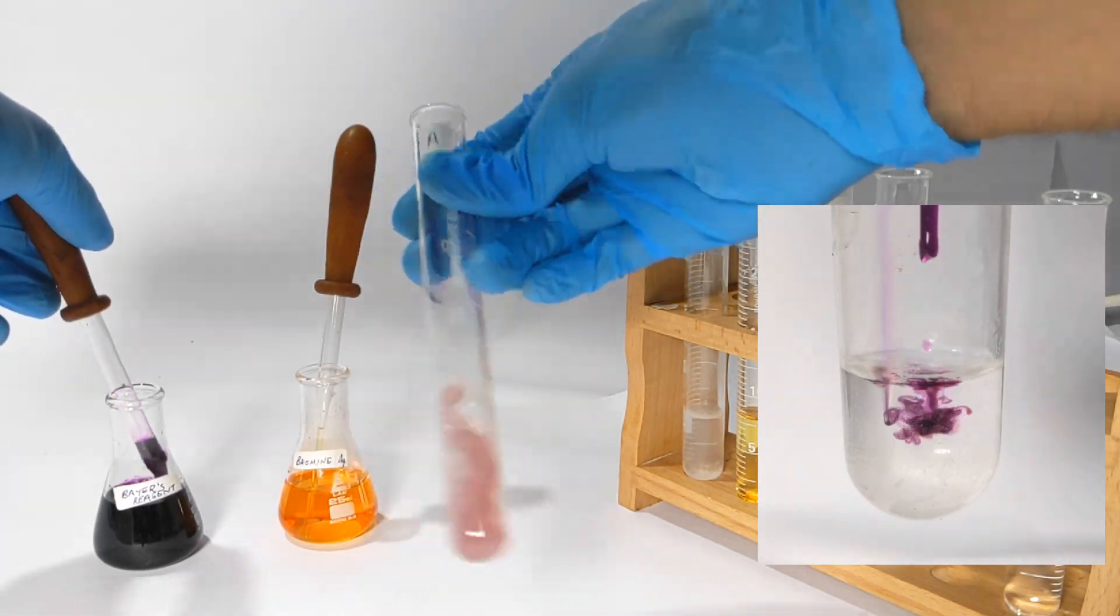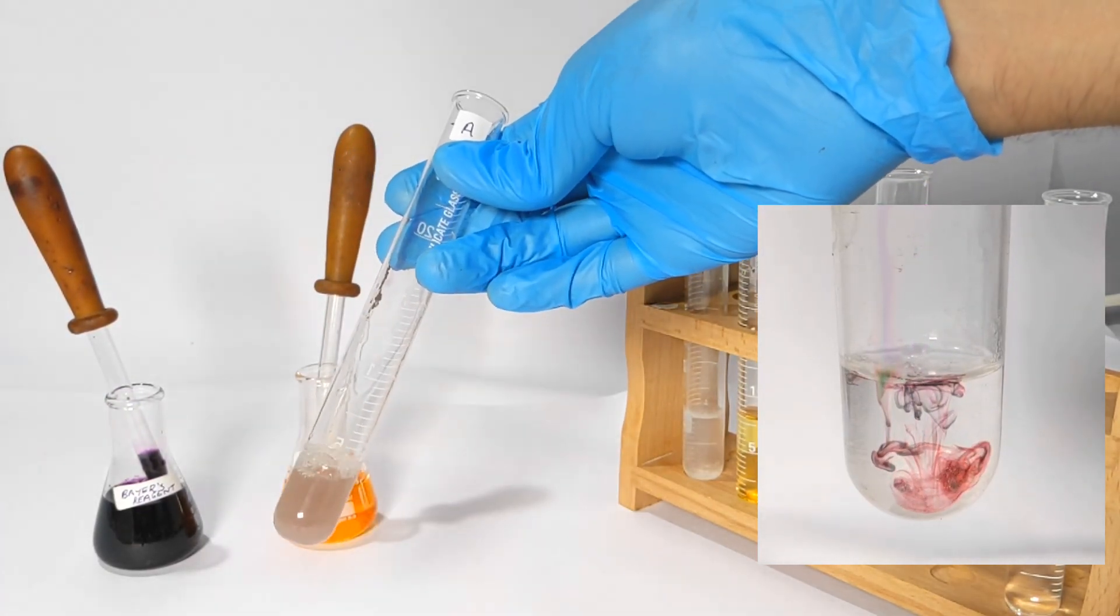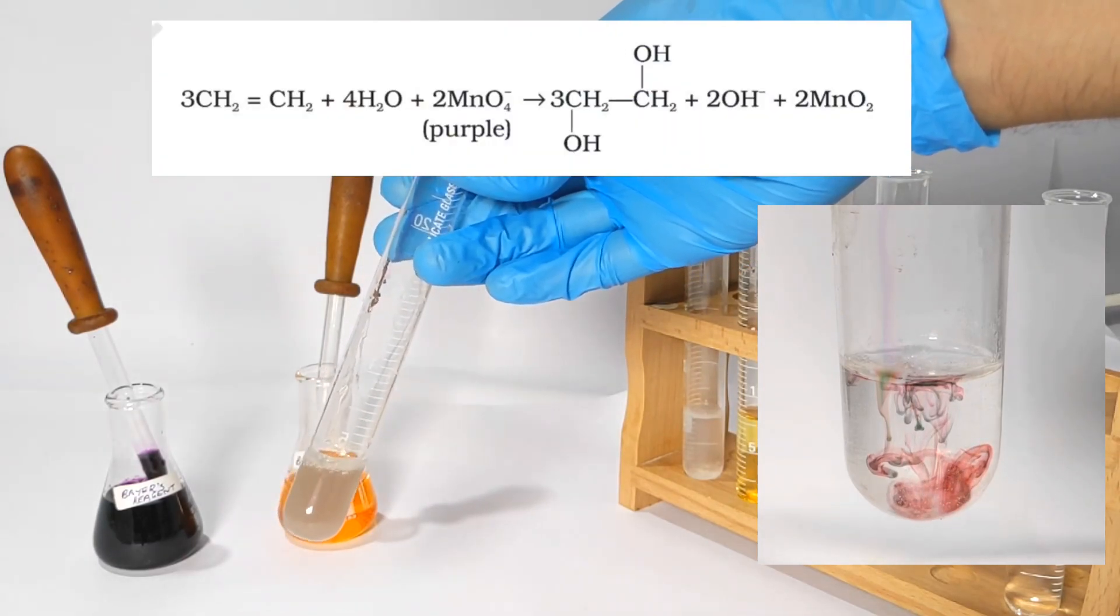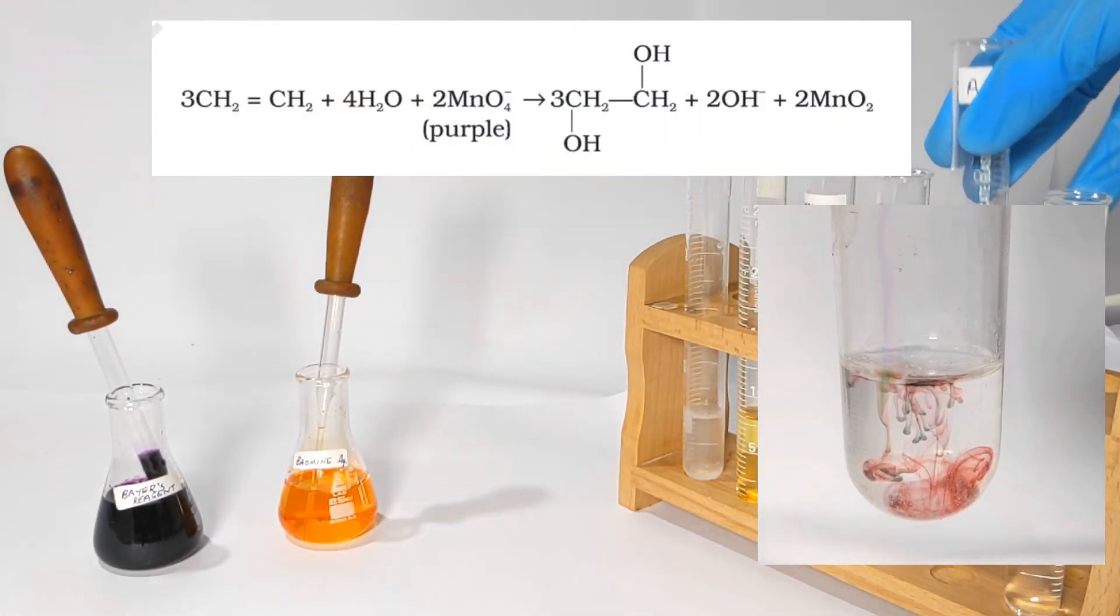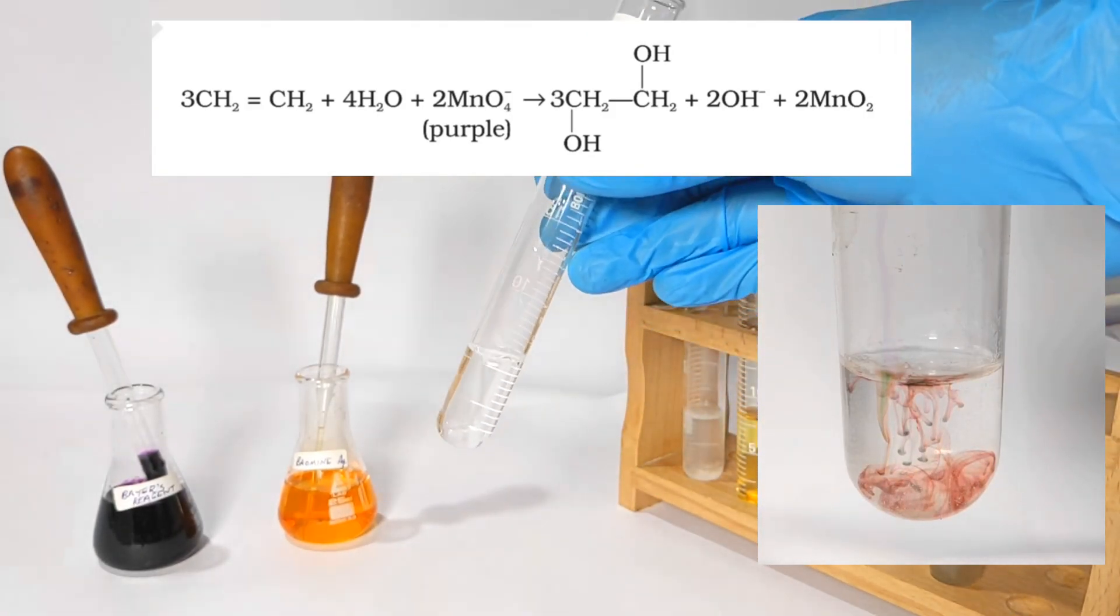This indicates a positive test as the unsaturated organic compound got converted to vicinal glycol and the permanganate reduced itself to manganese dioxide which being insoluble in water stays as a turbid brown precipitate.